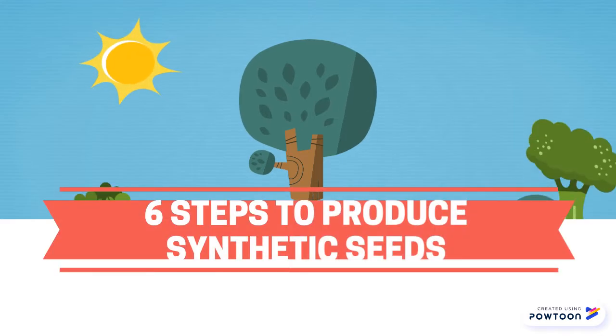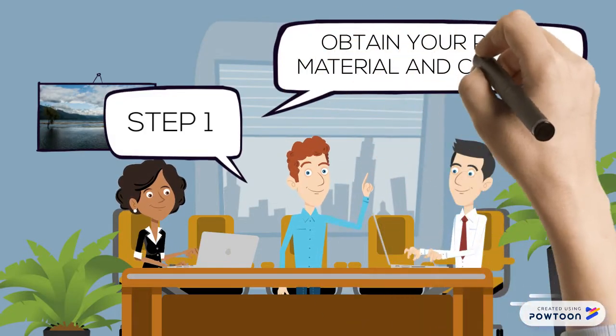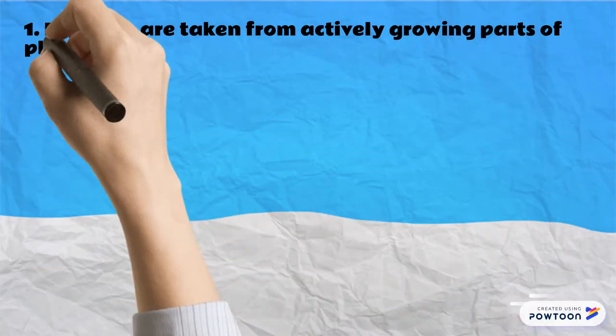There are 6 steps in producing synthetic seeds. Step 1. Obtaining your plant material and cultures. Explants are taken from actively growing parts.